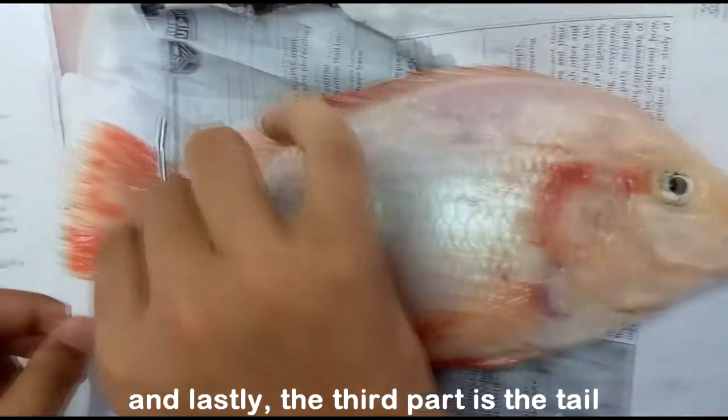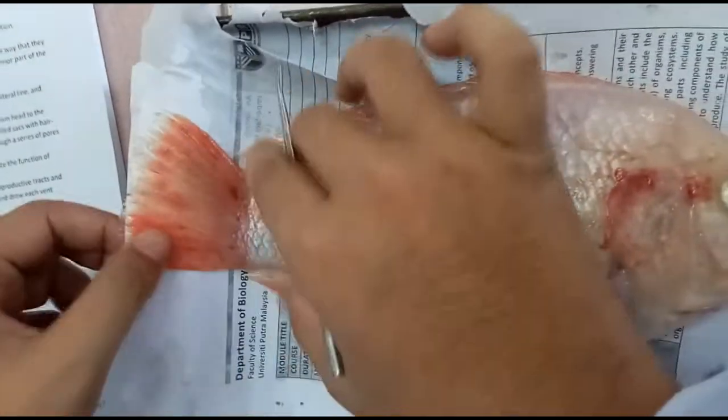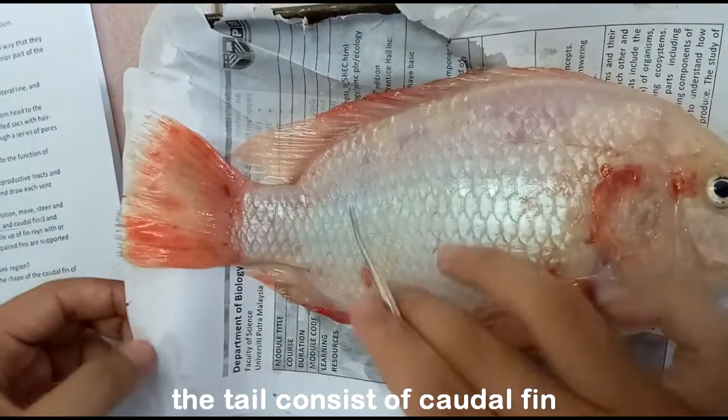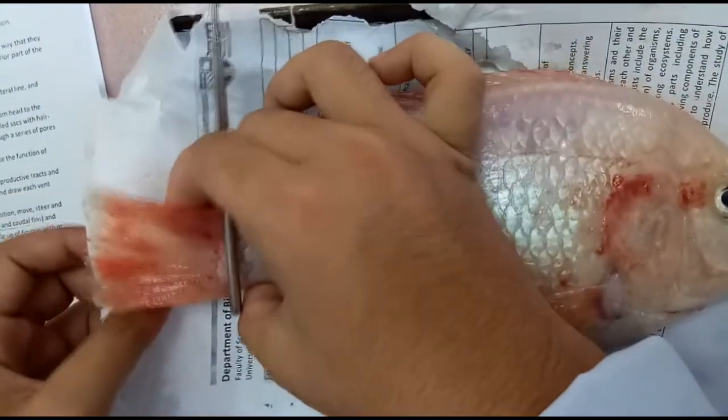And lastly, the third part is the tail. So as you can see, the tail consists of the caudal fin. So this is the tail.